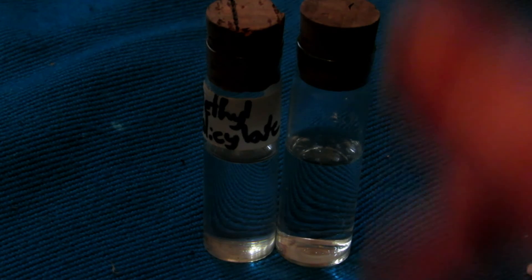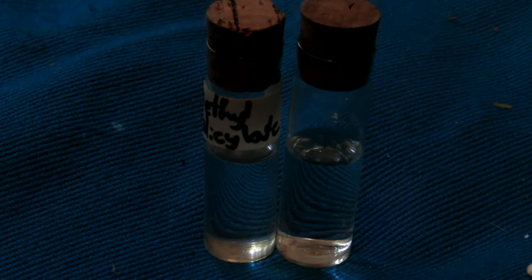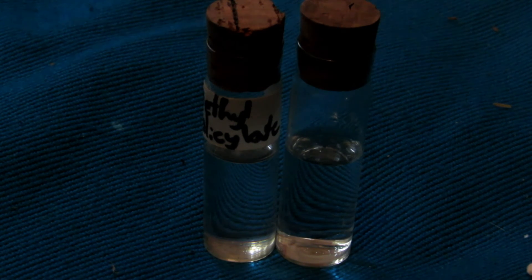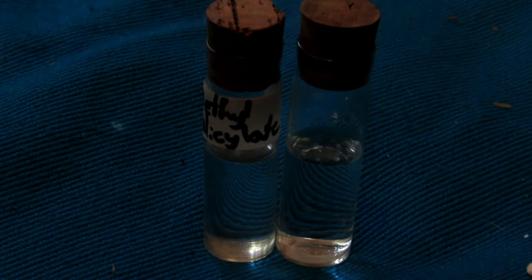We're going to use this to make something called smash glow crystals. Most smash glow crystals are really convoluted and complicated to make, and the chemicals aren't commonly available. However, this methyl salicylate was made from aspirin and other household materials.